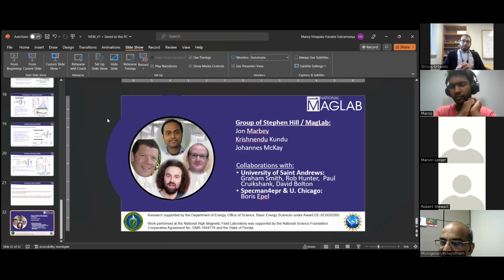The idea for choosing the nitroxide radical is that it's broad and has more features, like a clear g anisotropy and hyperfine components. We wanted to showcase that we have this one-shot detection and get the same features that we get from a typical field sweep or frequency sweep. But for such narrow lines, I think we can do it.